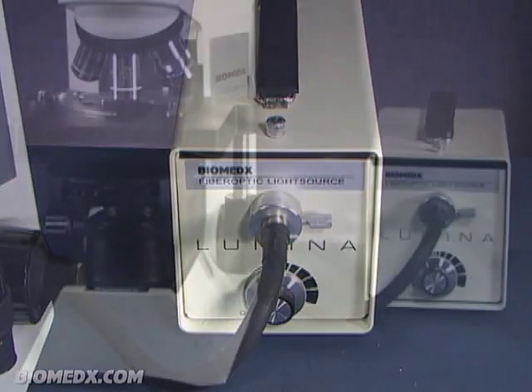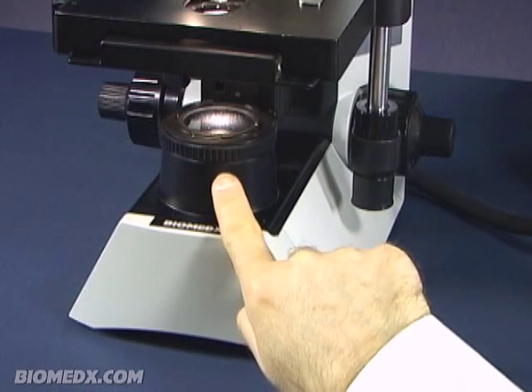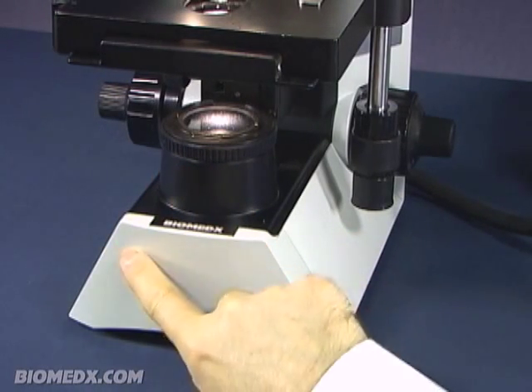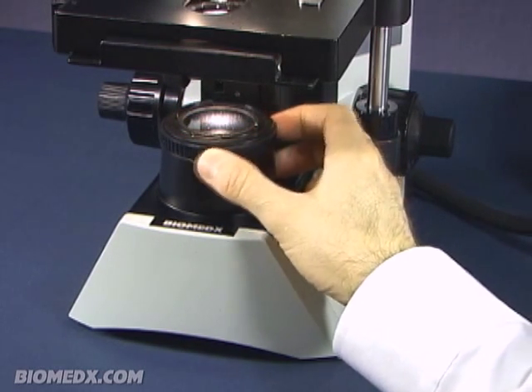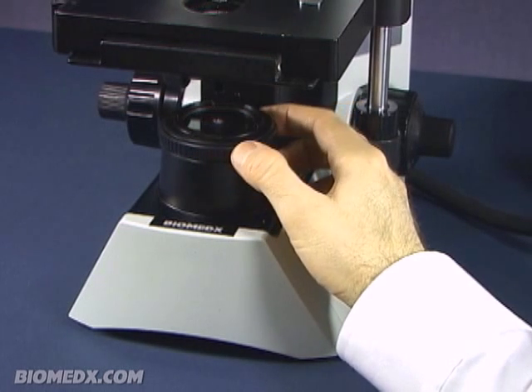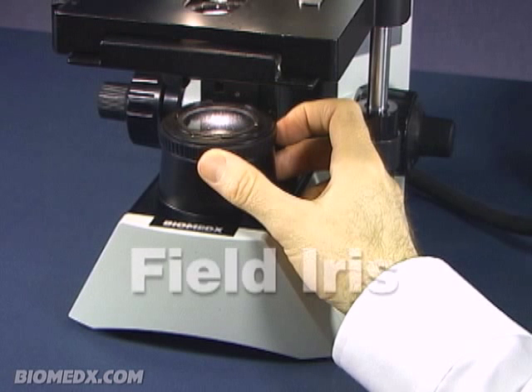The other end of the cable sits below the field iris assembly inside the base of the microscope itself, and this is where the light comes out. This is the field of light you see when you look into the microscope, and this field of light has an iris adjustment associated with it. Hence, this is called the field iris assembly.